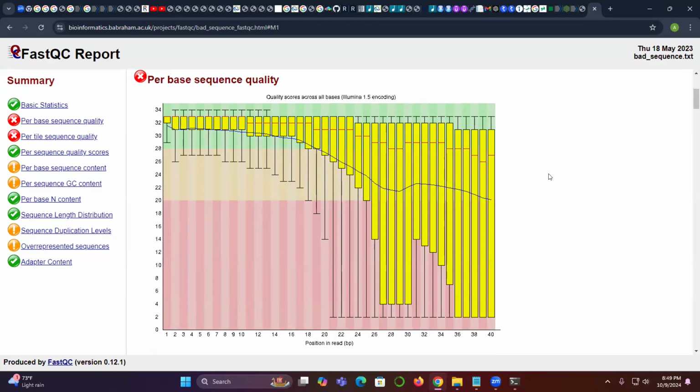And also on the y-axis, you can see the lines falling at the lower numbers here, 26, 24. Yeah. Can you see these lines? So they are falling below the cutoff of 30, right? So it is having bad quality here. So now you can see the QC for the bad and the good Illumina data. Clear? Yes. Now go back to our data.